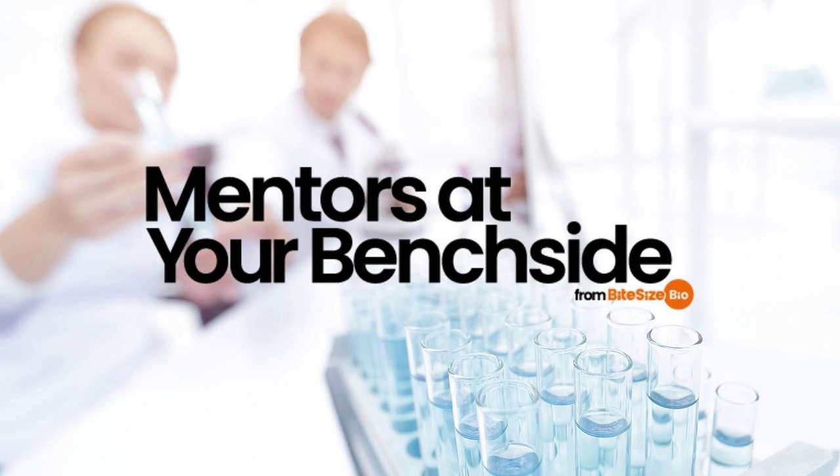Glutaraldehyde. Glutaraldehyde is extensively used in electron microscopy but is not as widespread in flow cytometry. This is because it's more effective at cross-linking than formaldehyde, making it harder for antibodies and dyes to stain structures effectively. It also increases cellular autofluorescence markedly. So, unless you have a particular reason for using glutaraldehyde, stick with formaldehyde or alcohol. A good rule of thumb, bearing in mind what we just said, keep this in mind: use formaldehyde for light microscopy and use glutaraldehyde for electron microscopy.